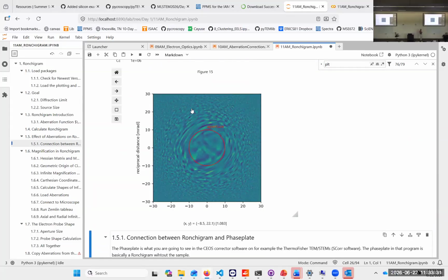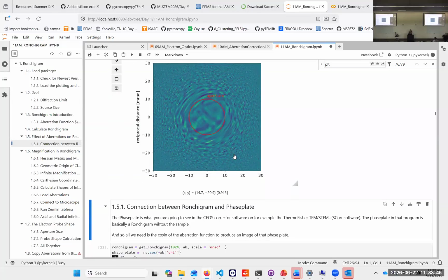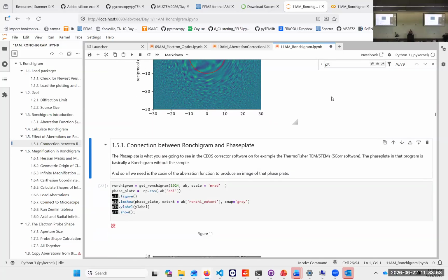that means your aberration corrector has very, very clearly defined directions that you can use. And so you can actually be sure that, whatever you calculate, at least with a single rotation, is back to where you want to be.